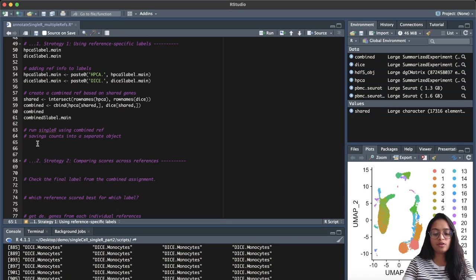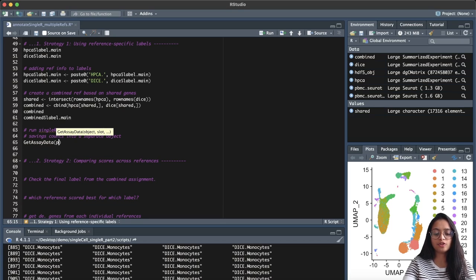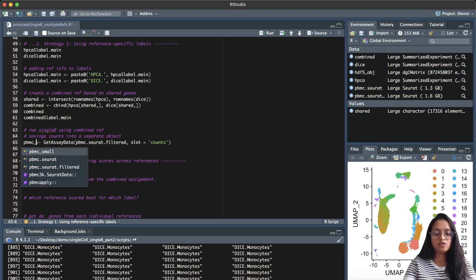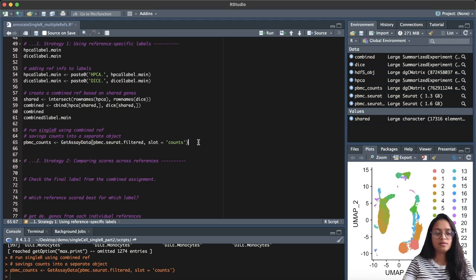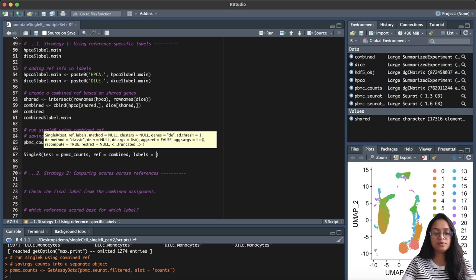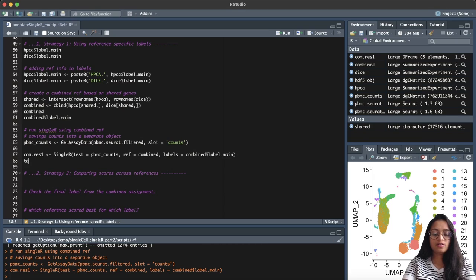We perform the annotation on our dataset using the counts data. To get that from our filtered object we use the GetAssayData function on pbmc.seurat.filtered with the count slot, which holds the raw counts, and save this into an object called pbmc_counts. Now we run SingleR: the test parameter is pbmc_counts, the reference is the combined reference we created, the labels we provide are label.main from the combined reference. We store the output into a variable called combined_result_1.